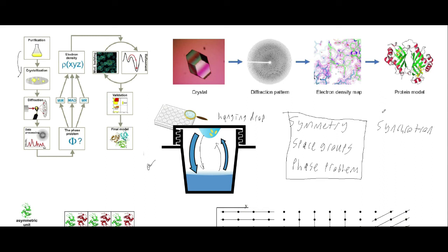The one that I used in my undergraduate research was the one at Argonne National Laboratory, just outside of Chicago. What's happening is you're accelerating electrons around the particle accelerator, so they're going in that direction. As the electron bends through this, it's releasing energy as X-rays.